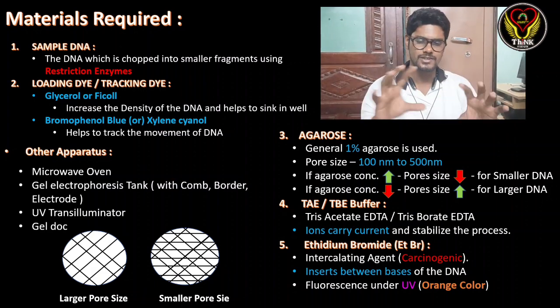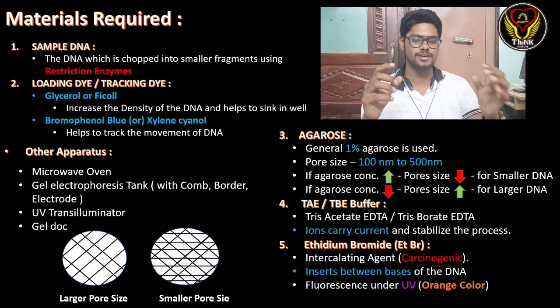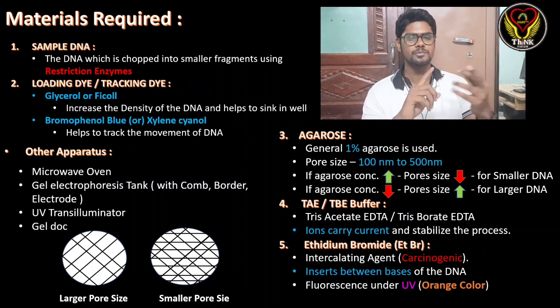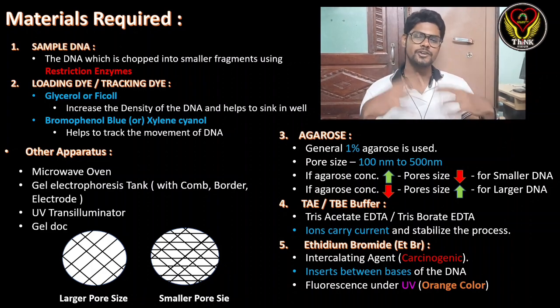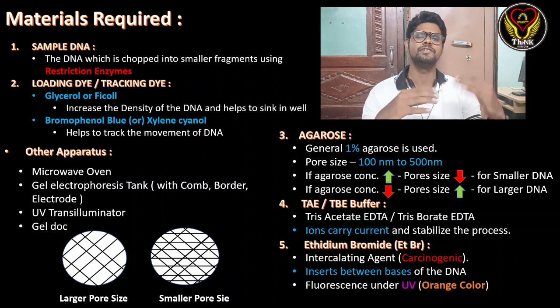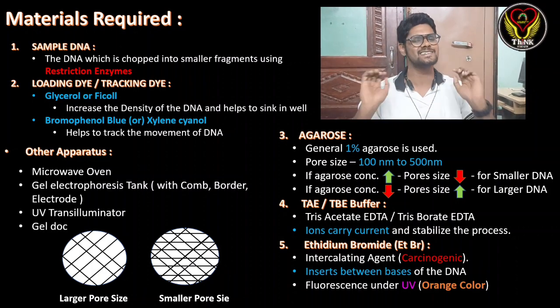So apart from all these things, we need a microwave oven to dissolve the agarose gel, and a gel electrophoresis tank with a comb, border, and electrode, a UV transilluminator to visualize, and lastly a gel doc, to identify our DNA bands and how they have been separated. So these are the important materials.